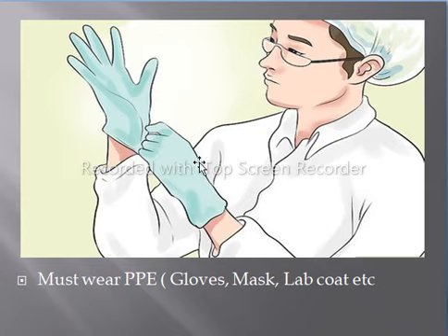Well, before starting work at the lab, you must wear personal protective equipment, such as gloves, lab coat, mask, etc., which aims to protect yourself from hazardous, toxic or pathogenic microbes.